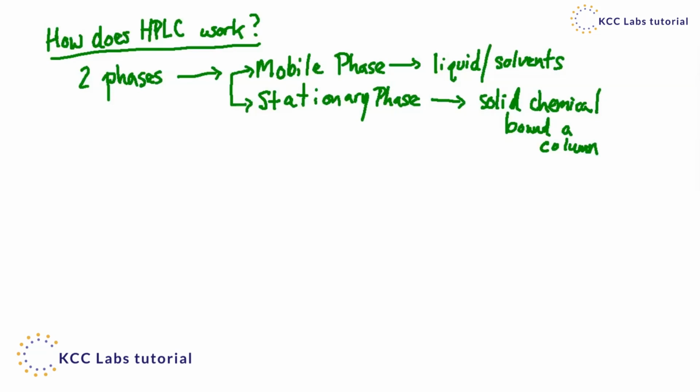And the goal with HPLC is you want to separate these materials out as best you can. You don't want them clustering together. Again, going back to something like a column that you would be running on a bench top in an organic synthesis type of manner, when you have a column like that, the goal is to separate the compounds out into different sort of aliquots of solvent. You don't want to just bleed all of them down together, otherwise you haven't really done any type of chromatography and separation.